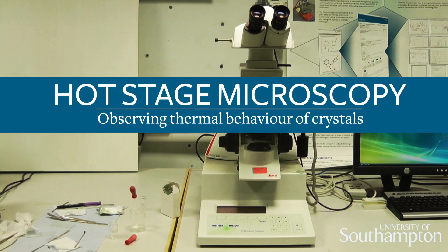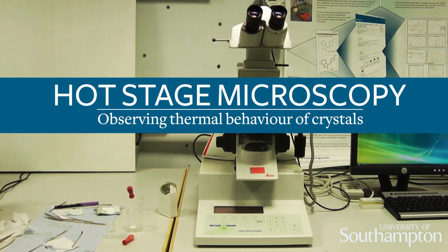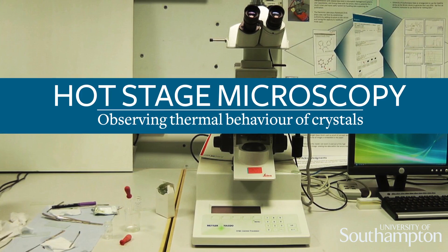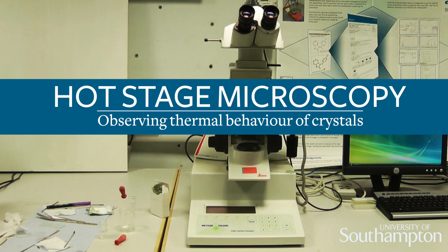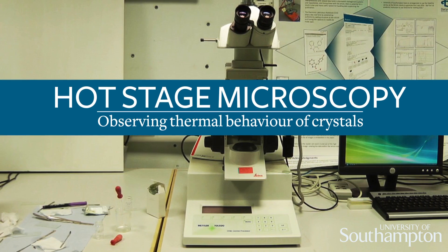Hot stage microscopy is an analytical method for visually recording changes when a sample is heated or cooled. It is particularly used in studying liquid crystals, but here we are using it to observe whether the sample changes form before reaching its melting point.